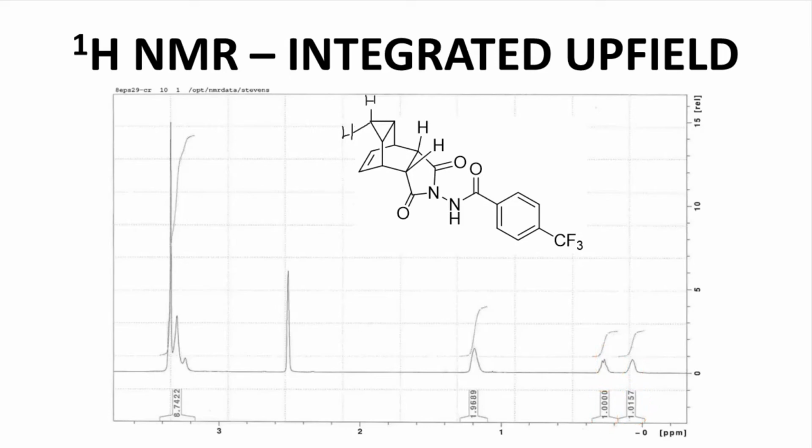The two remaining CHs overlap because of symmetry in the structure and appear at about 1.2 ppm, 2 hydrogens based on the integration. I will note that the two signals around 0 ppm are kind of lumpy. In the anhydride starting material, these signals are much sharper and resemble quartets. In this structure, almost no coupling is visible. These peaks look like broad lumps. That's surprising, and we'll be able to explain these broad signals once we finish analyzing the spectrum. I do still want to make a comment about the lack of shape of these peaks at this time.